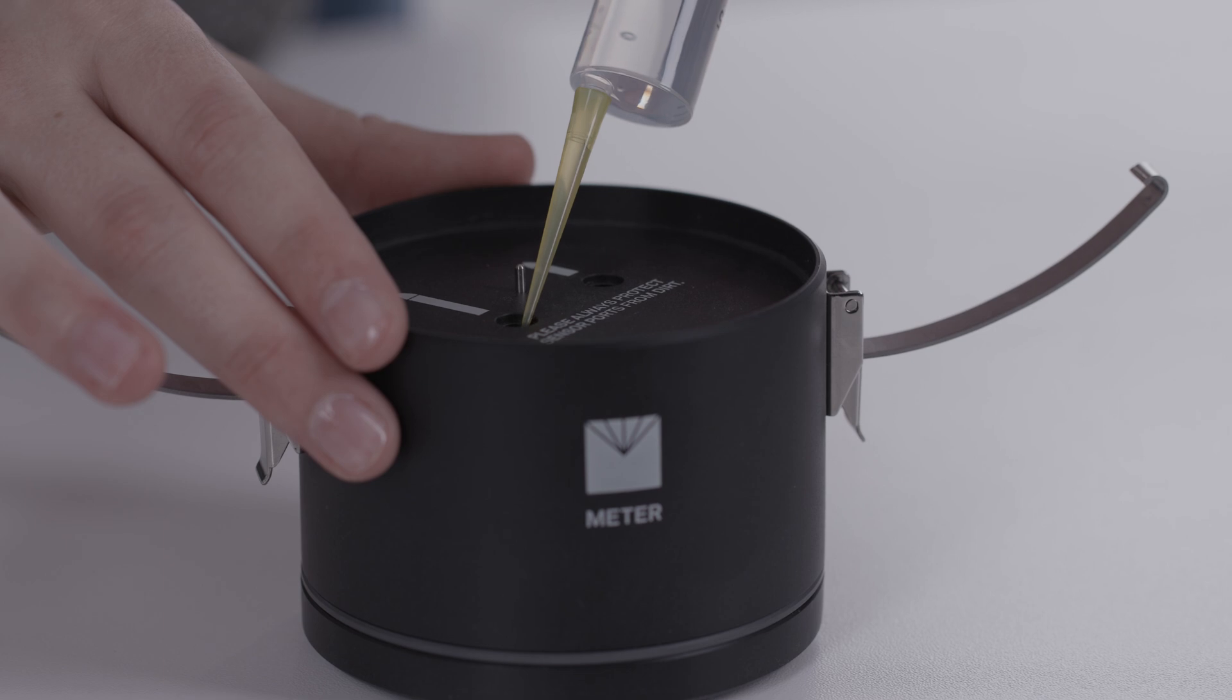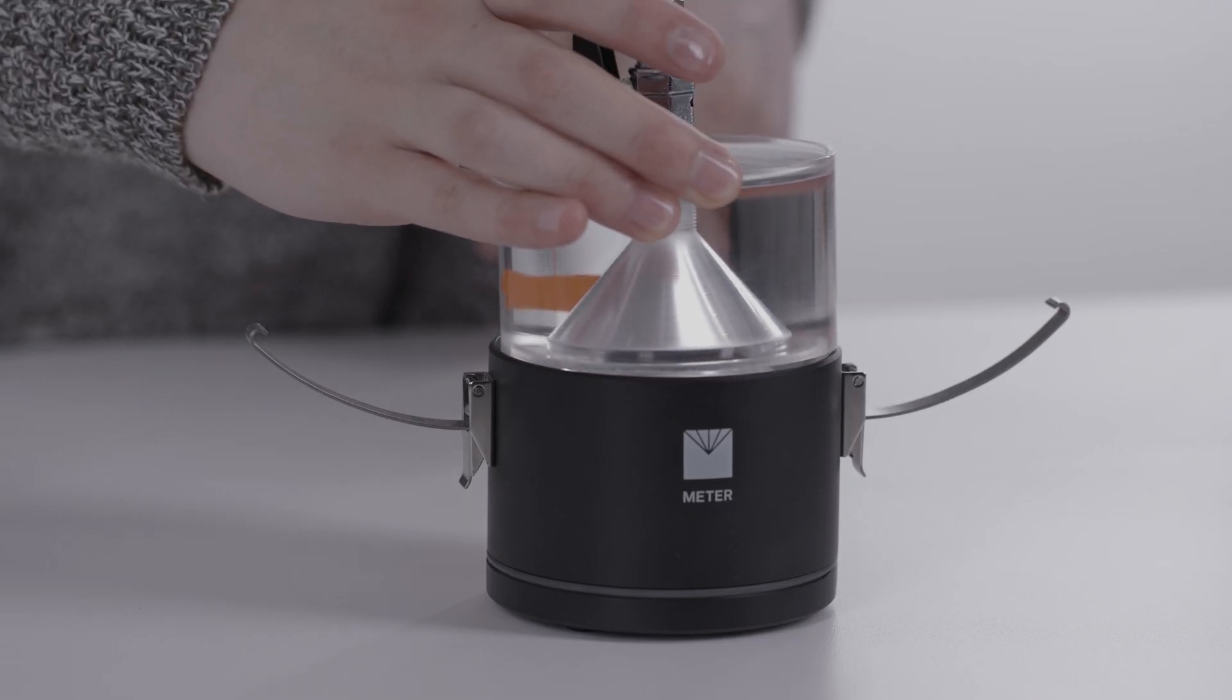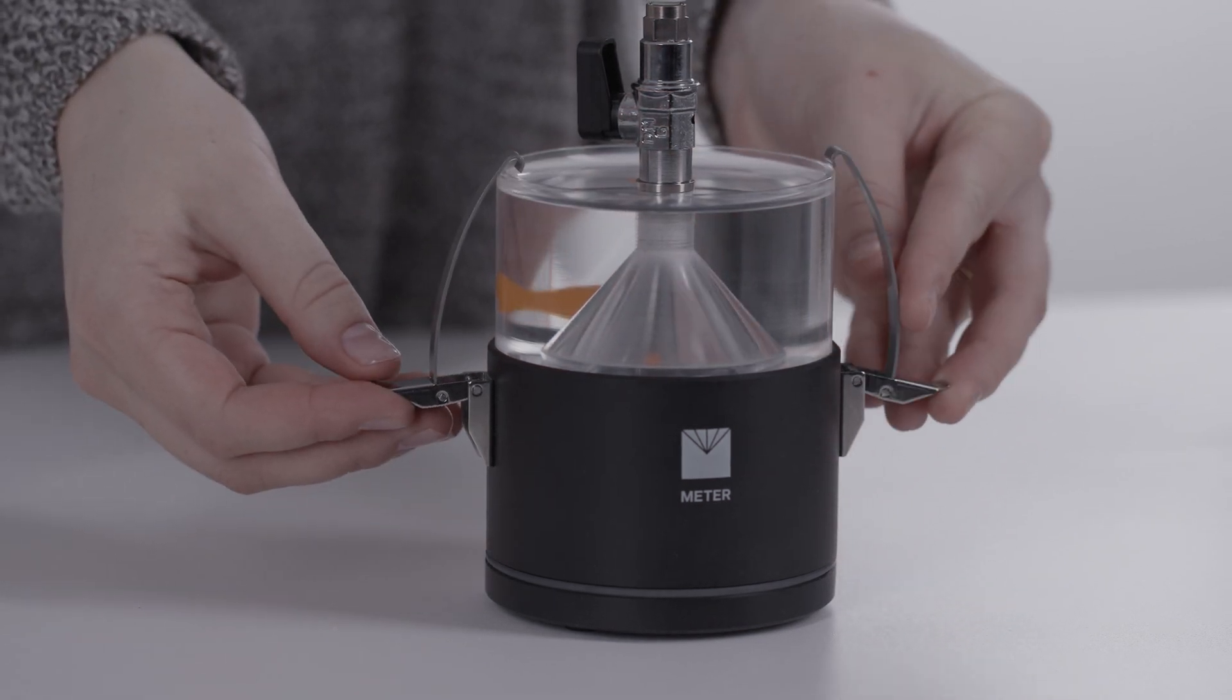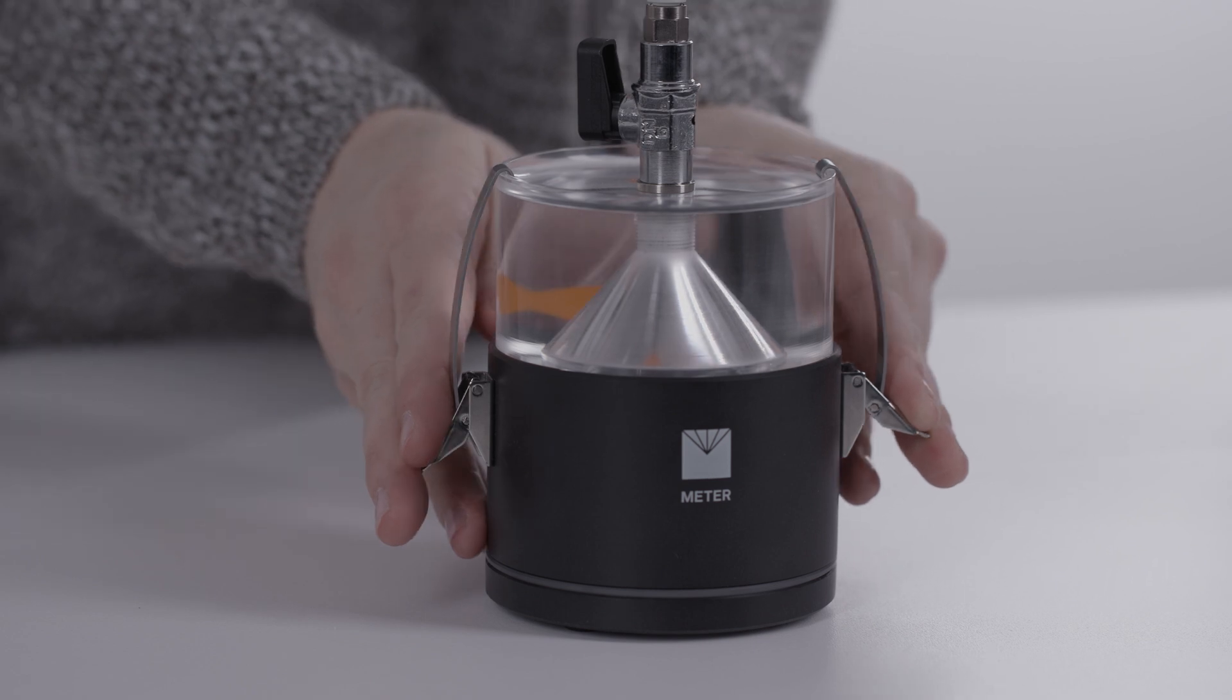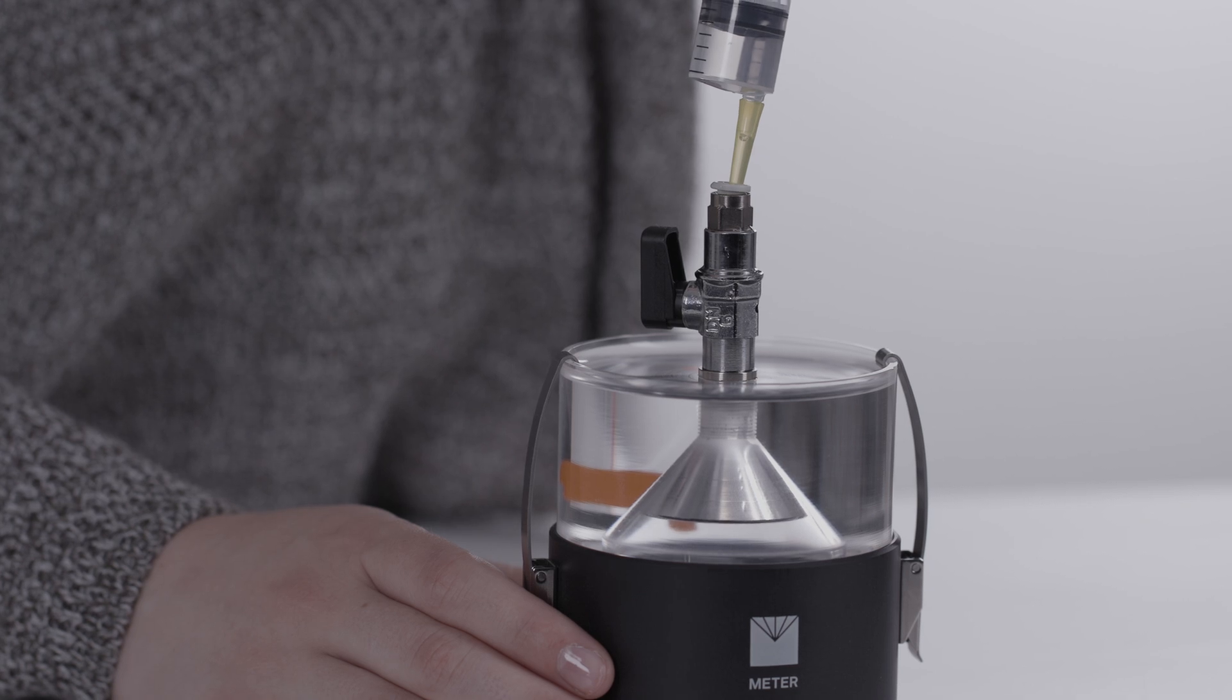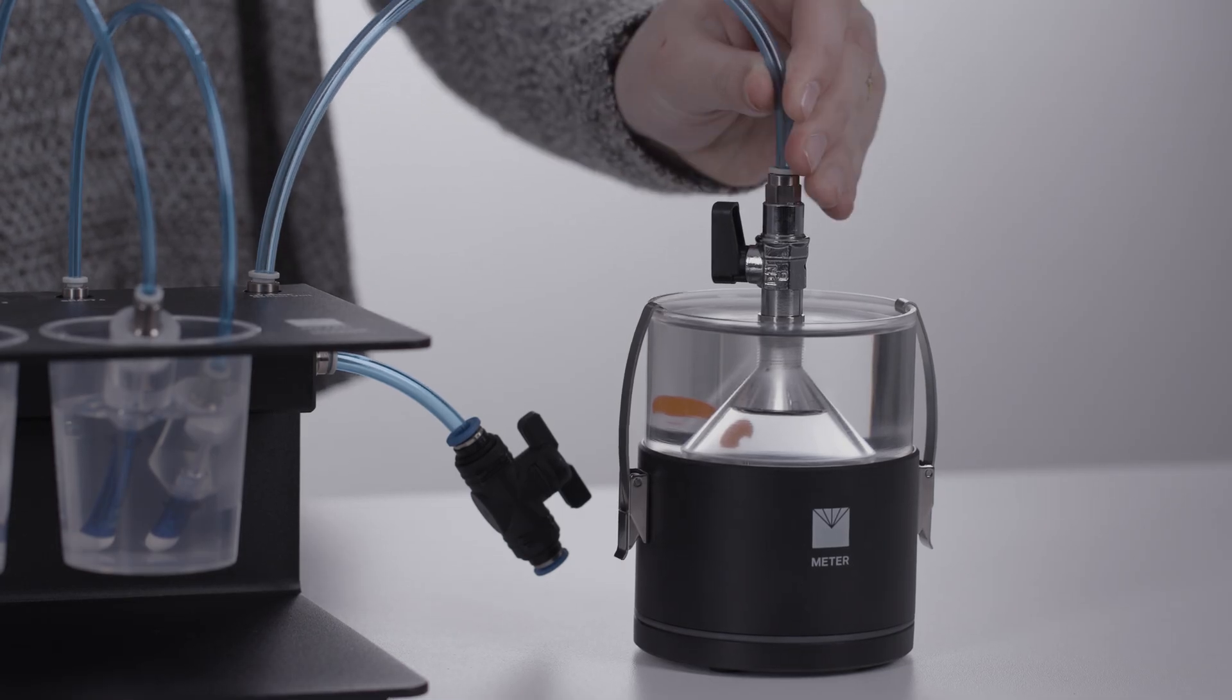Fill holes of the sensor unit with degassed water using the droplet syringe. Place the refilling attachment and clamp it down. Fill the attachment with 23 milliliters of degassed water using the droplet syringe. Attach the high prop to the refill unit.